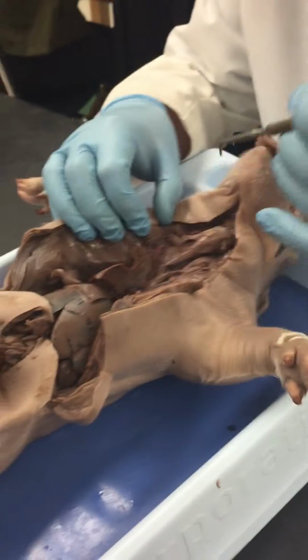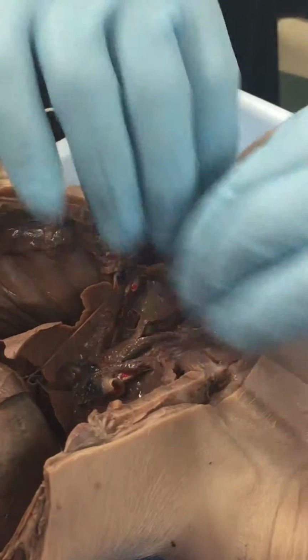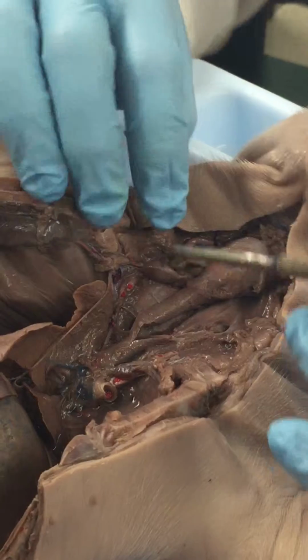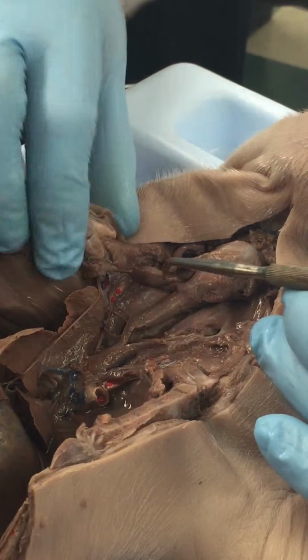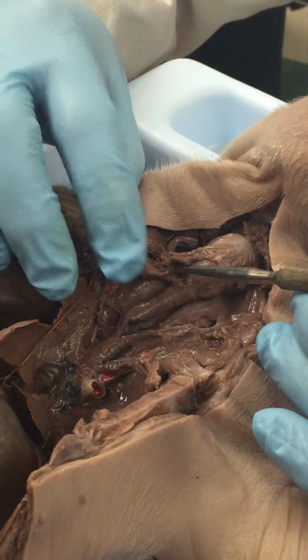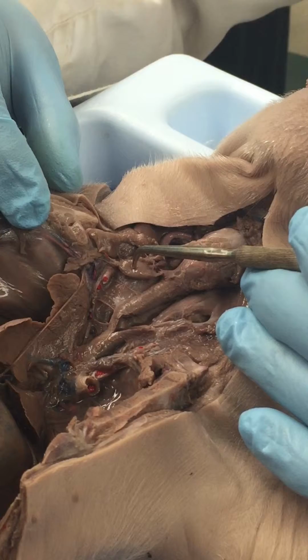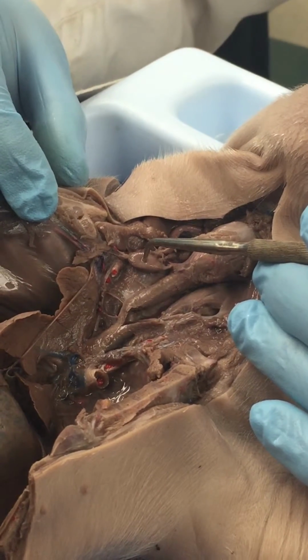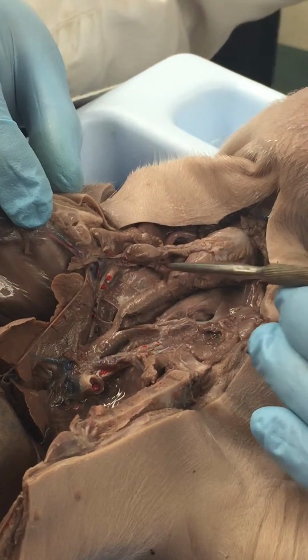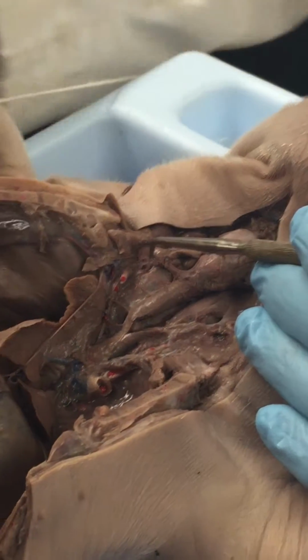Okay? Thyroid gland is not necessarily going to be seen in a lot of pigs, but this is it right here. When we open it up like this, it deflects it to one side or the other. The thyroid gland should sit right here at the base of the larynx and on the trachea. This is it. So again, on the practical, I'll put a thyroid gland there because this is it, and that's not where it's found technically. See what I'm saying?